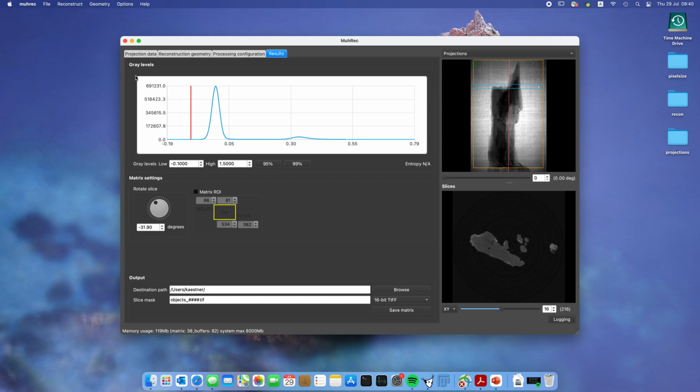This looks, well, maybe not perfect. So maybe we would have to do some additional adjustments to get it right. I didn't do that thorough center correction for the 700 slice, so maybe we would have to do some refinement.